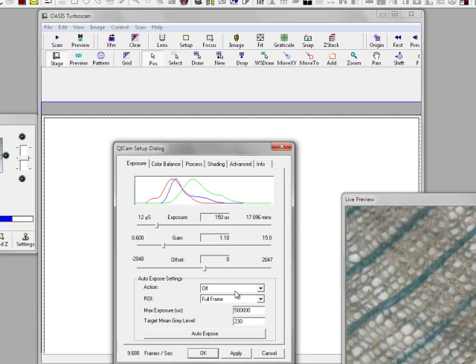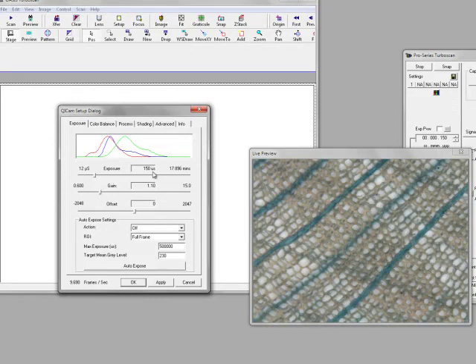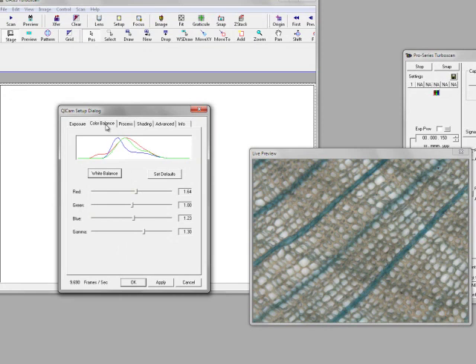Right, so first thing is I can control all my exposure times. I'm going to try and keep my exposure time less than 200 microseconds. That enables me to tile this very, very quickly. In a bright field environment where I have a lot of light, this isn't a problem, but obviously if we move to fluorescence, it will slow down a little bit. So what we'll also try and do is we'll probably do a white balance.